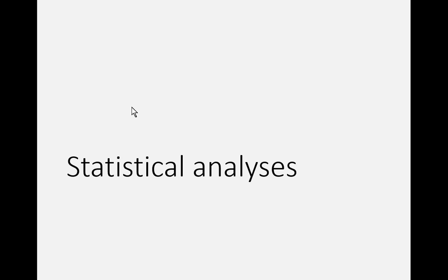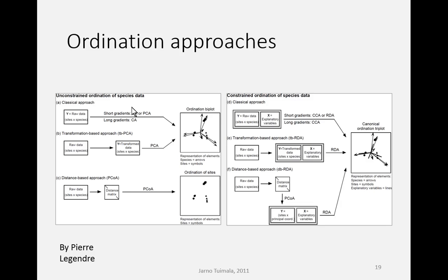Any questions this far? Okay. Can I ask something? Sure. So what's the difference? Why couldn't I just use the principal component analysis for this? I mean, it's to separate the groups, and this RDA gives me also the effect of one feature. Sorry, maybe I don't understand this.